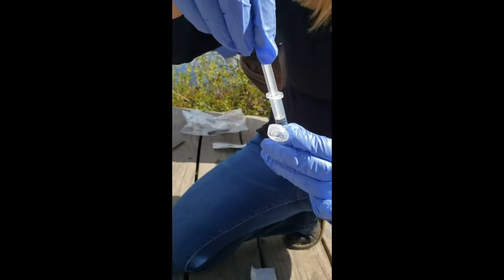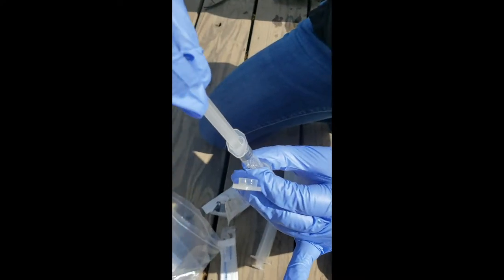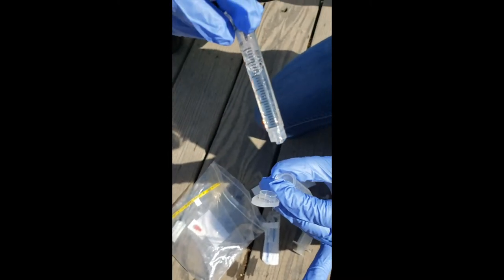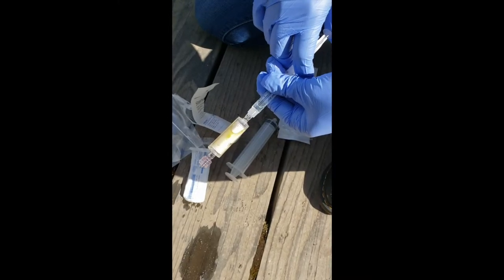Take the Zymo solution, which preserves DNA, and add it to the filter by screwing it onto the end and pushing it in.